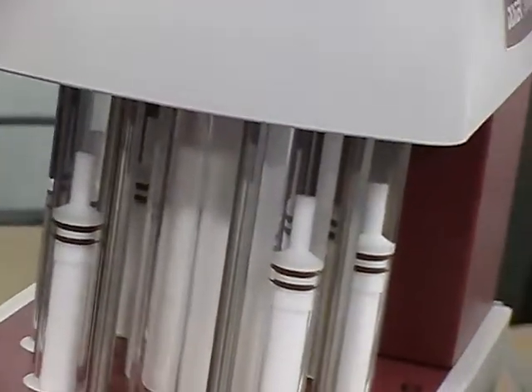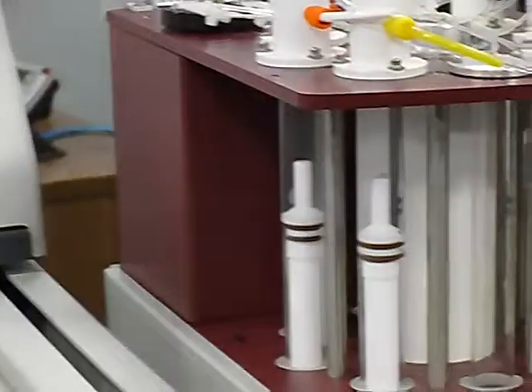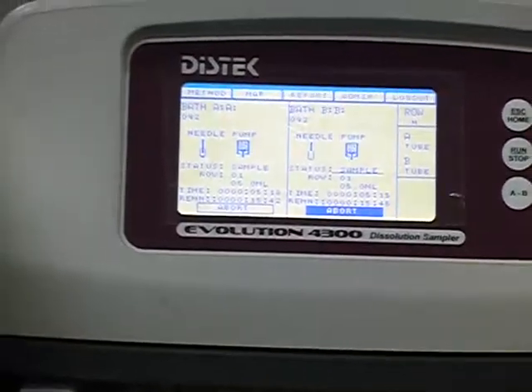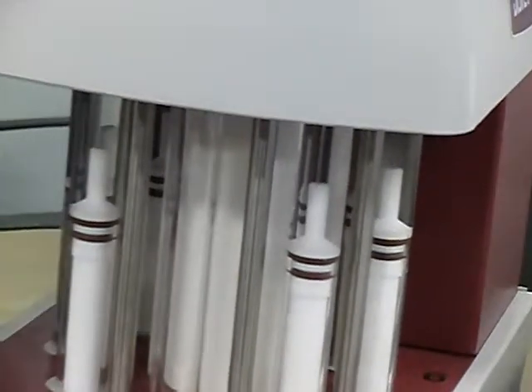If they've got to pull that media through a filter before it gets up into the line, and the piston's still going, now you're creating vacuum. You've got suction going on, so I can see where pulling it slower may make collecting the sample easier. But as soon as that's done, you need all those other functions to go quick.